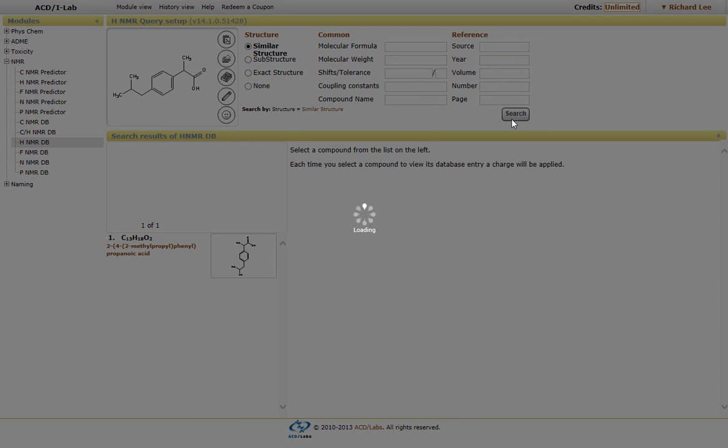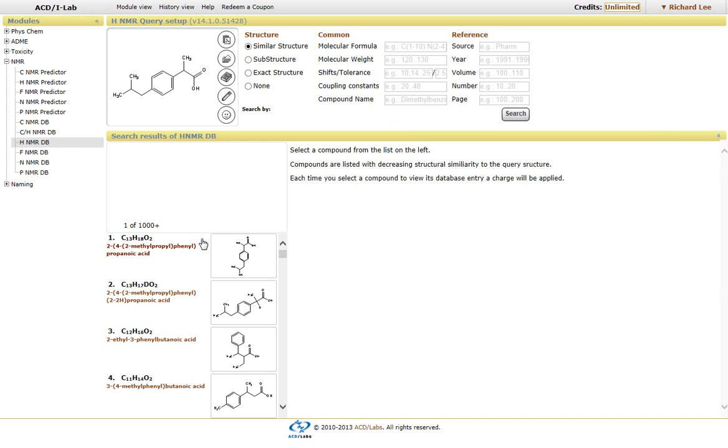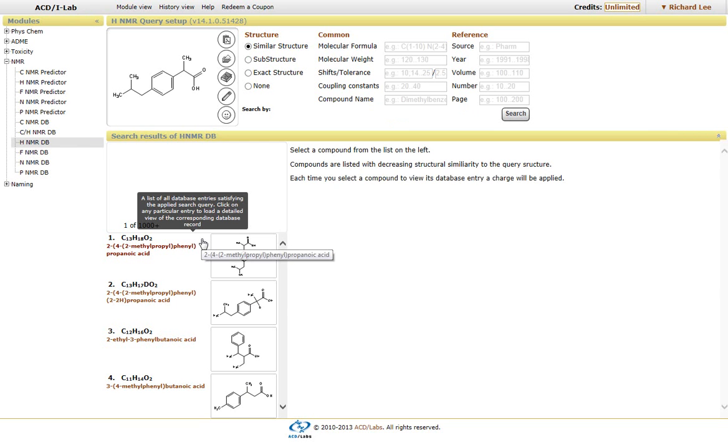it will look through our database of proton NMR, as well as its structures, associated structures, and it will bring up the top candidates. Now, because there are no restrictions that I've placed, it pulls up a few thousand possibilities.